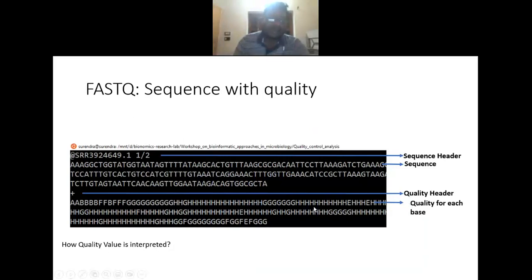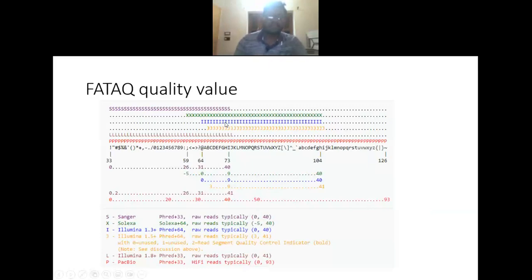And they are written here in certain encodings, like this character A, B, B. So they are written here in an encoding. If you see this one here, come back here. So the value here is the 65.